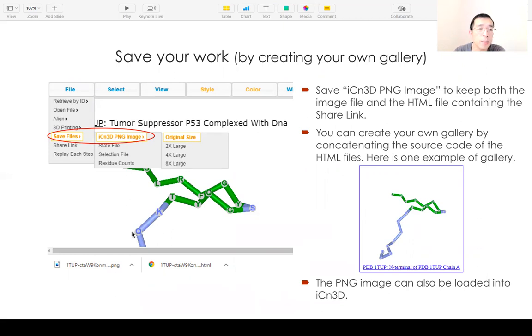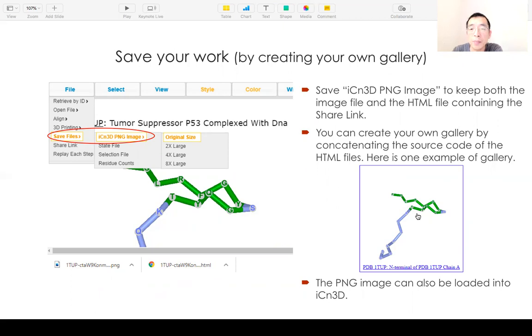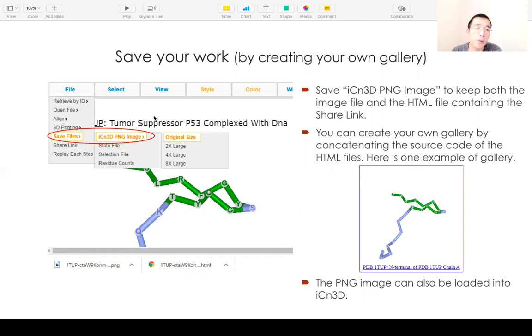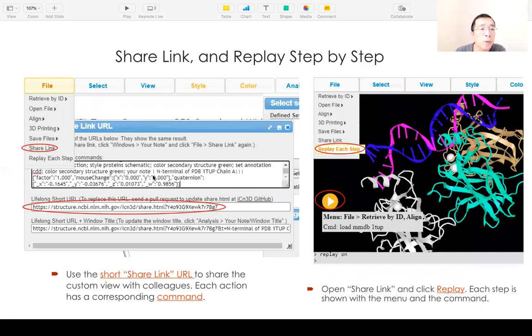This will save two files: one is the PNG image, and the other is an HTML file which has a link to the image. You can click it and your custom view will be displayed. If you have multiple HTML files, you can concatenate them in a text editor to generate your own gallery. The PNG image can be loaded back into iCn3D via 'Open File > Open iCn3D Image'. You can also click 'File > Share Link' and all your data and custom display will be saved in a short URL — a lifelong short URL you can share with colleagues.